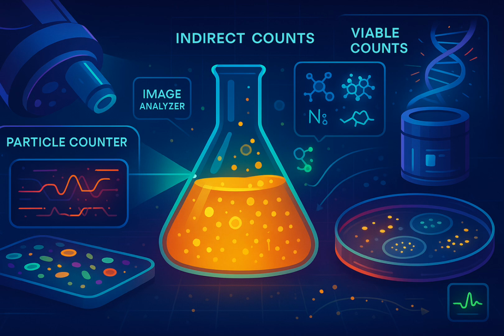Okay. And the most intuitive physical way, just weigh them. The dry biomass assay. Very fundamental, especially in things like fermentation studies. You take a known volume, collect the cells. Centrifuge or filter. Yep. Then wash them. Why? To get rid of salts or sugars from the medium that would add artificial weight. But don't overwash, or you might lose stuff from the cells. Checking balance, then weigh. Then dry them completely, usually in an oven at 105 Celsius until the weight is constant. That can take 12, 24 hours. Then weigh the dry mass.